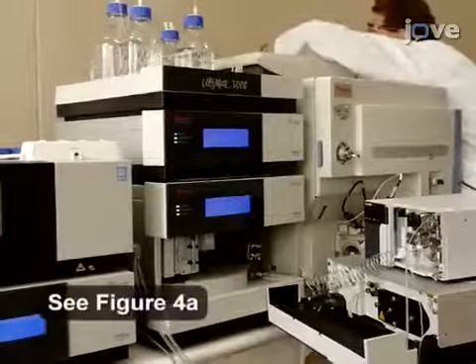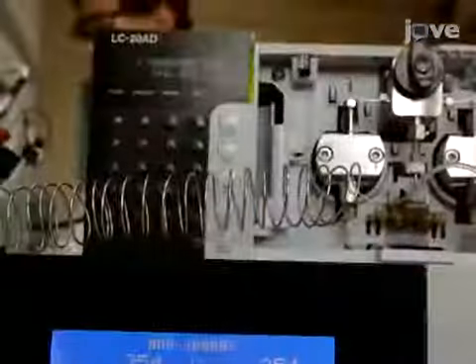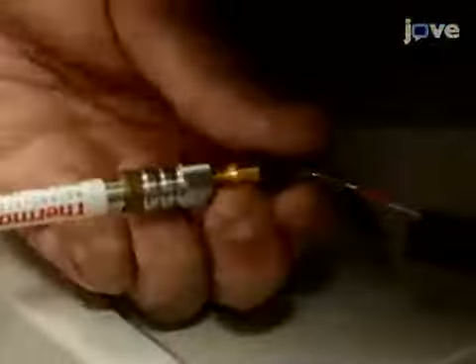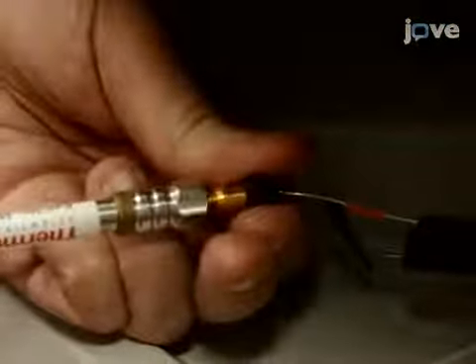Set up the HPLC instrumental components and the additional derivatization pump. Following this, set the UV-VIS detector to analyse at a wavelength of 520 nm. Connect the inlet of the Reaction Flow, or RF, column to the HPLC instrument.